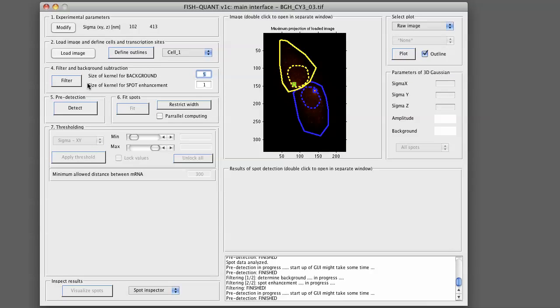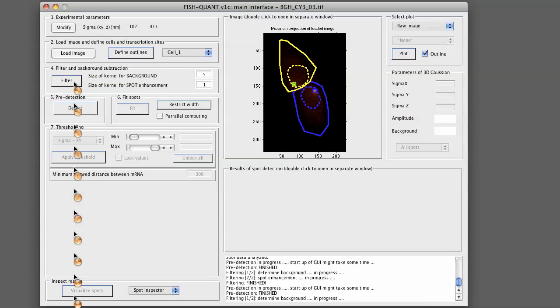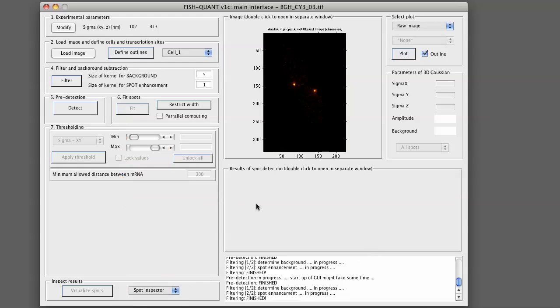To perform the filtering, you simply press on Filter Image. This will be relatively fast for those images here. It might be slower for yours, so you might have to wait a few seconds.